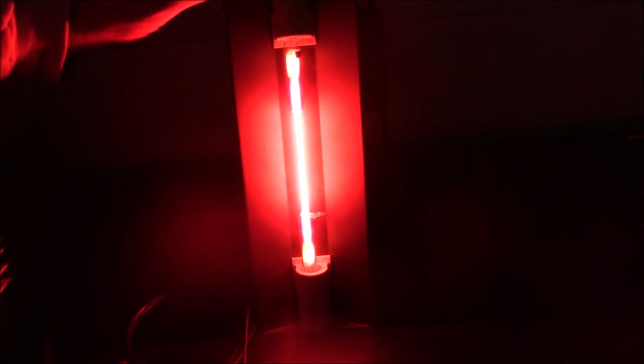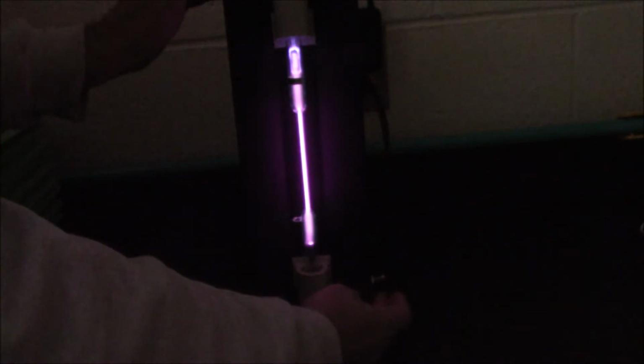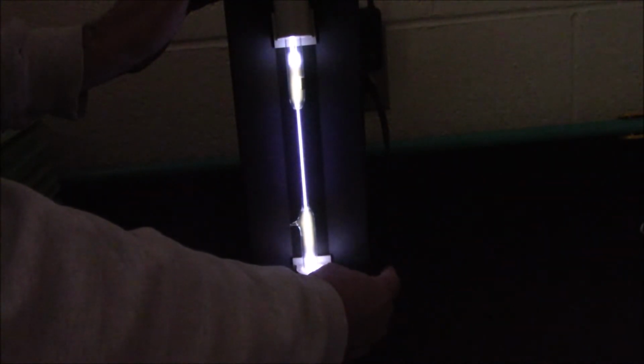Next up, neon. And that might remind you of neon lights because that's exactly how this is done. And neon lights are not all neon. Next up, I've got argon. Next up, I've got krypton. And last, I have chlorine gas.